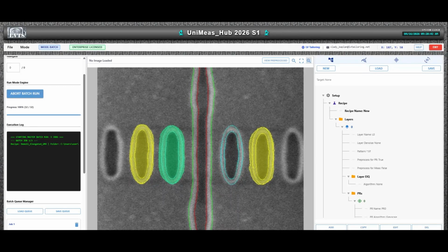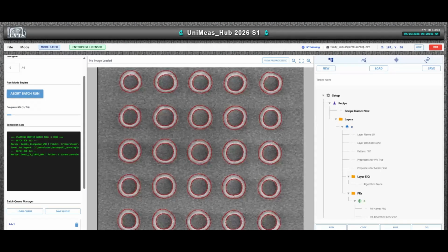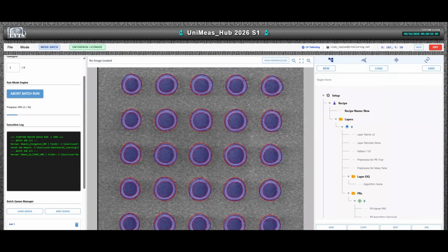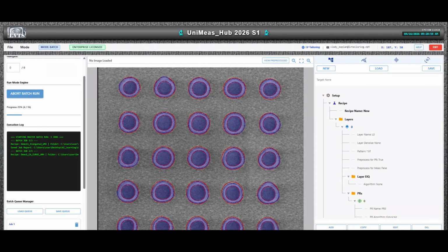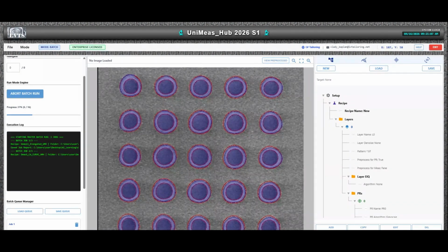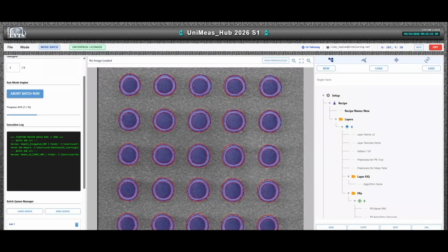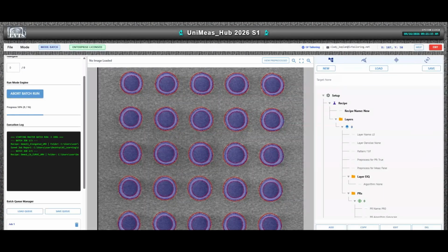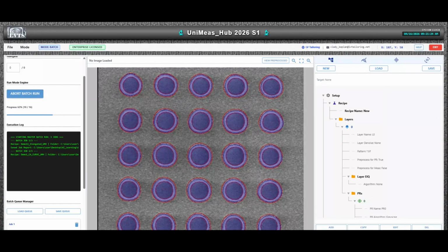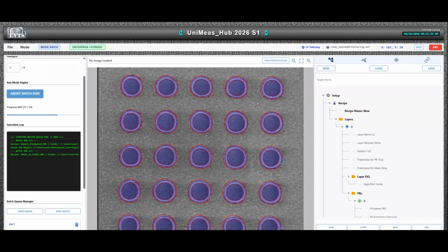To keep the user informed, a live execution log and progress bar update rapidly on the screen. The command to update the progress bar is explicitly placed at the absolute end of the execution loop, ensuring it increments for every single image processed. This strategic placement completely prevents the interface from freezing at intermediate percentages if corrupted files are skipped.